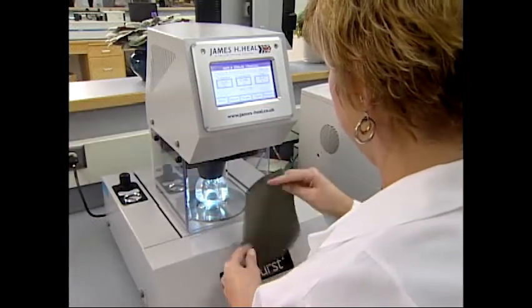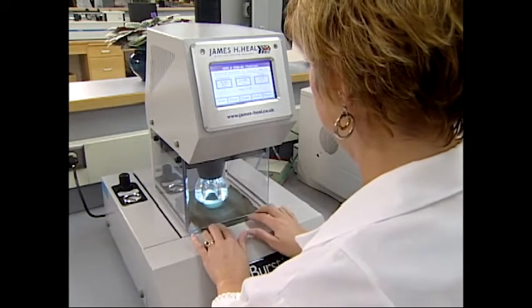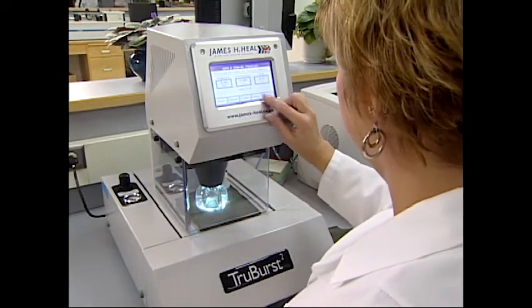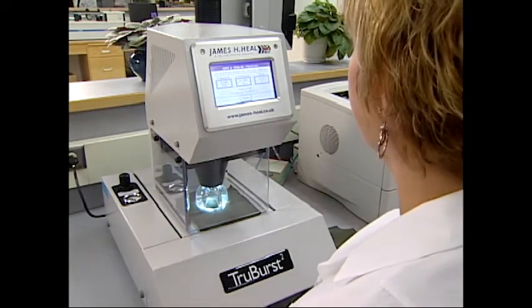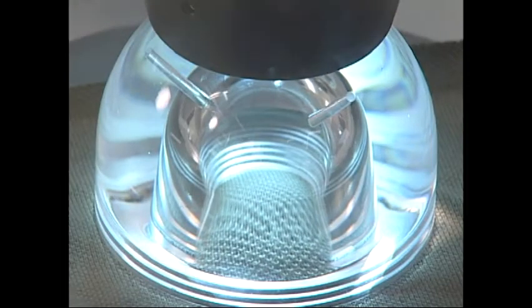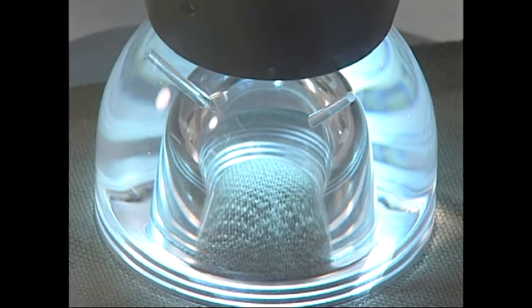Many fabrics that inherently have stretch, such as knits, cannot be tested using tensile and tear strength test methods. The strength of these fabrics is measured using instruments that burst the fabric. The bursting strength of a material is the capacity of the fabric to resist the stretching force required to rupture the structure. This force is applied at a right angle to the plane of the fabric.